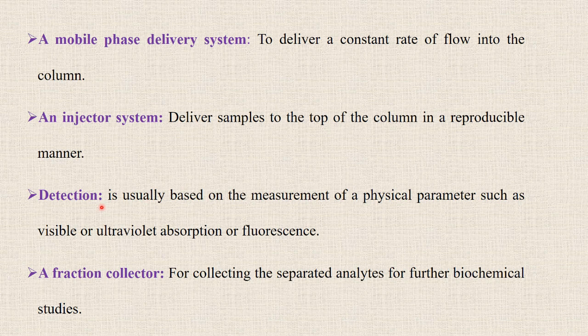And the next one is detection. The eluted substances or fractions are detected, and then the fraction collector. Different fractions are collected in different tubes or collecting vessels.